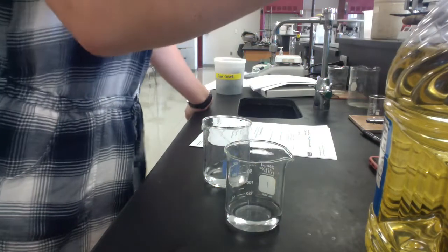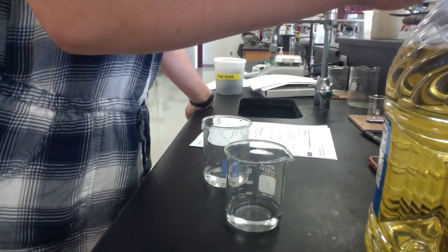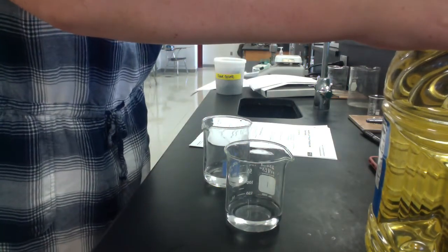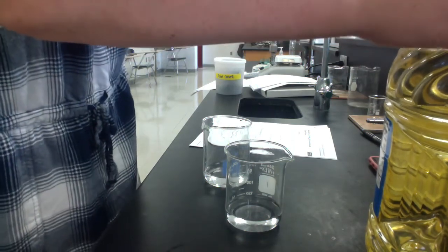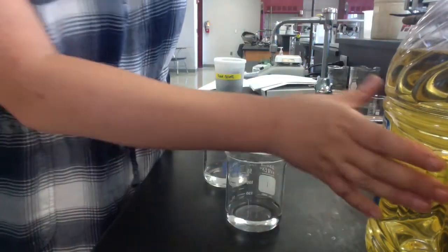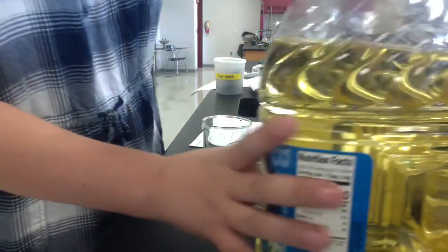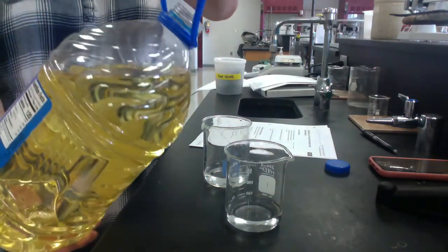And then it says to add to both beakers twice as much vegetable oil as there is water. So because I used 50 mils of water, I'm going to use 100 milliliters of oil here. So I'm going to get to 150.